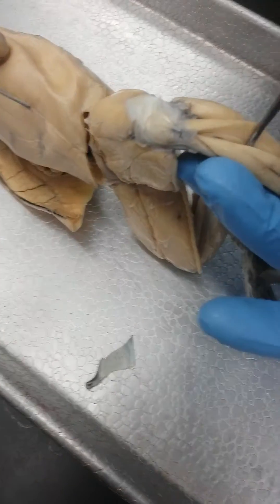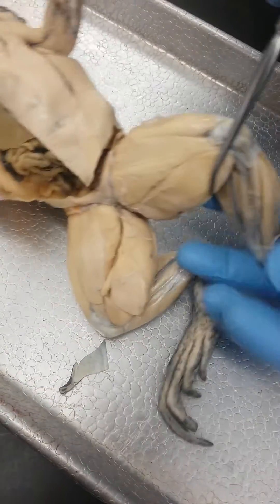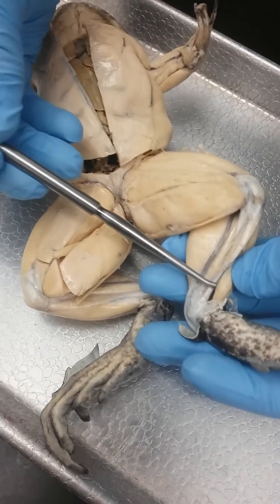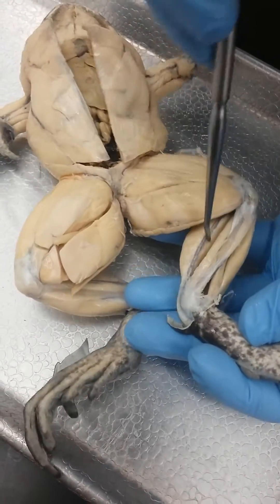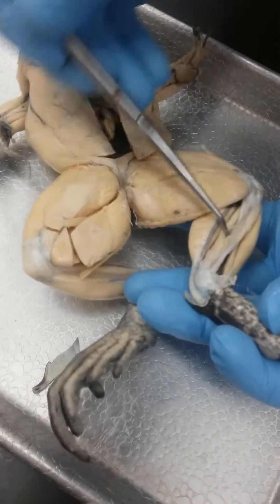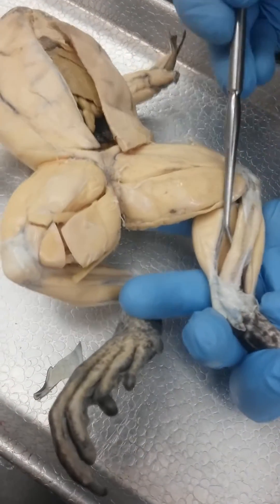Right next to peroneus is tibialis anterior longus. And then right behind that is tibialis anterior brevis. And then this muscle right here is tibialis posterior.